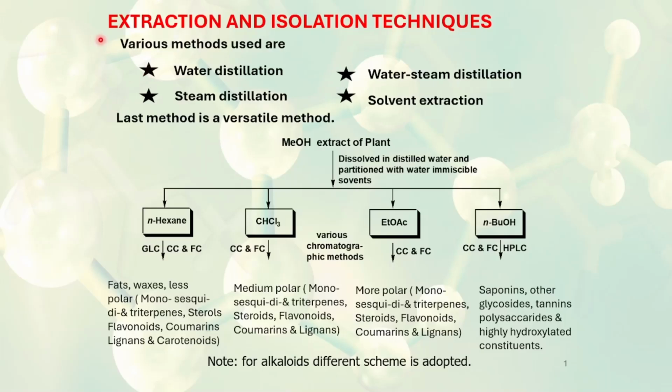Today we will talk about extraction and isolation techniques. There are various methods used for the extraction and isolation: water distillation, water steam distillation, and solvent extraction. The last method is the versatile method used for the extraction and isolation.